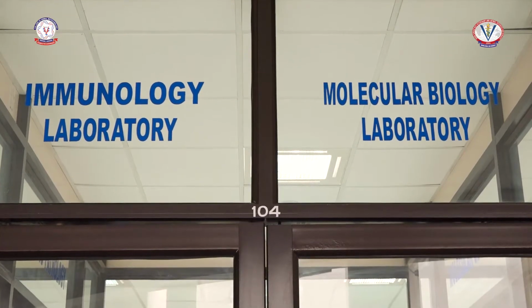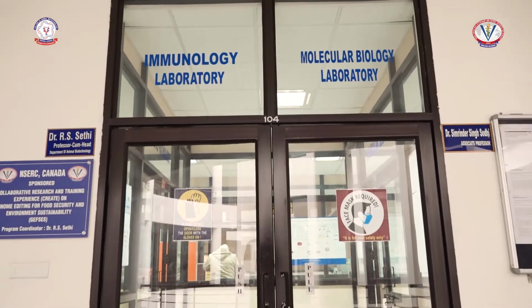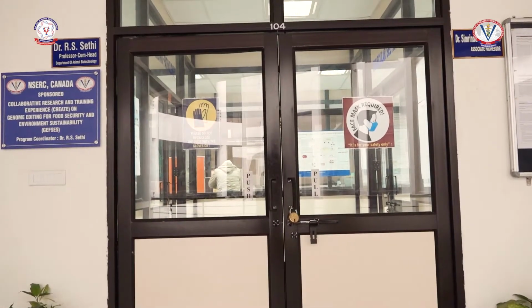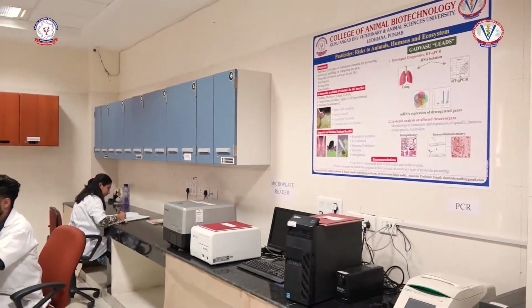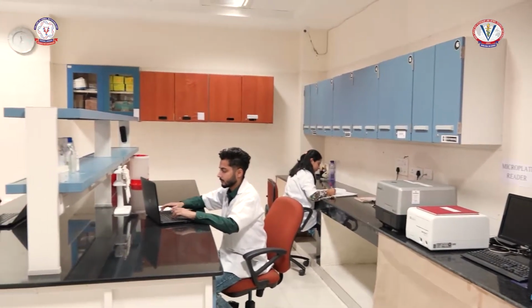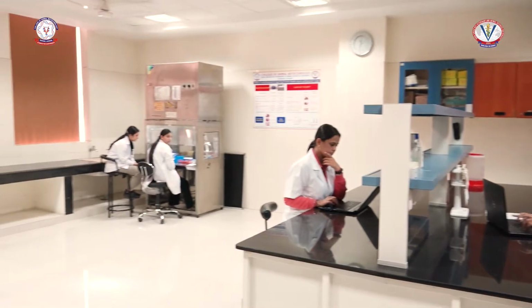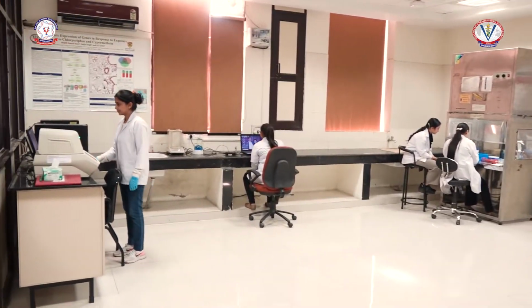To achieve this goal, the Cell and Molecular Biology Lab of the College of Animal Biotechnology has taken a step forward. This lab mainly focuses on the regulation of gene and protein expression through various advanced molecular biology tools. In this video, we will be discussing enzyme-linked immunosorbent assay, which is commonly known as ELISA.